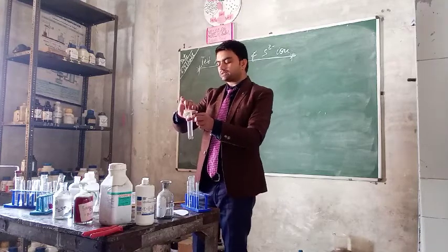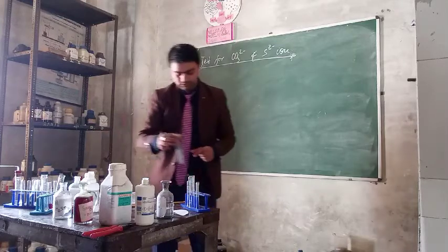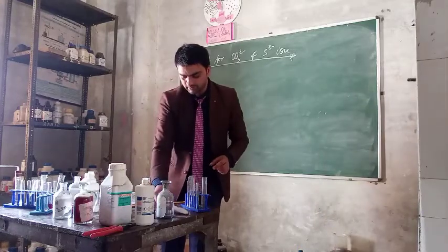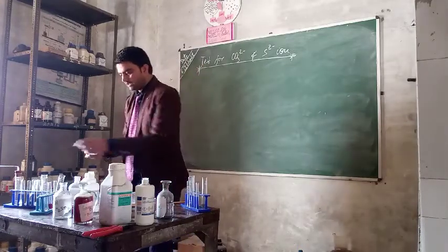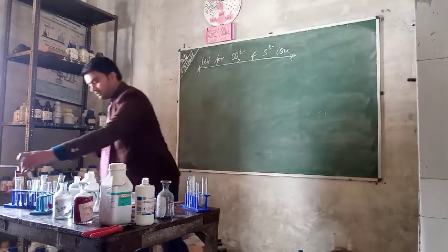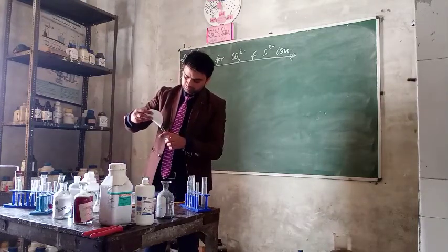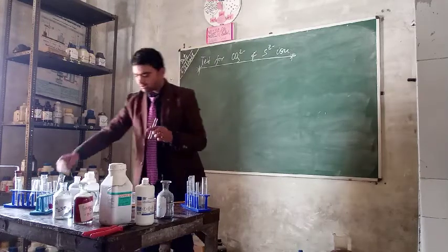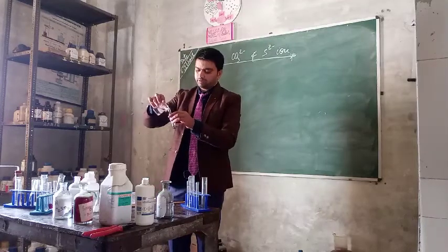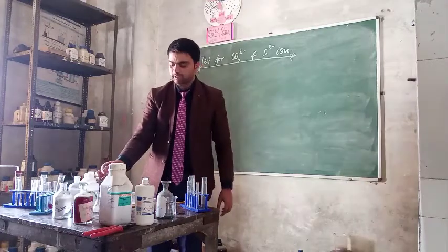Next, the confirmatory test. This is the first confirmatory test for the sulphide ion. Now again, the second confirmatory test you can also see here. First of all, we make the aqueous solution of the salt. This is the salt, and we add a few drops of water, and we will heat this to form the aqueous solution.